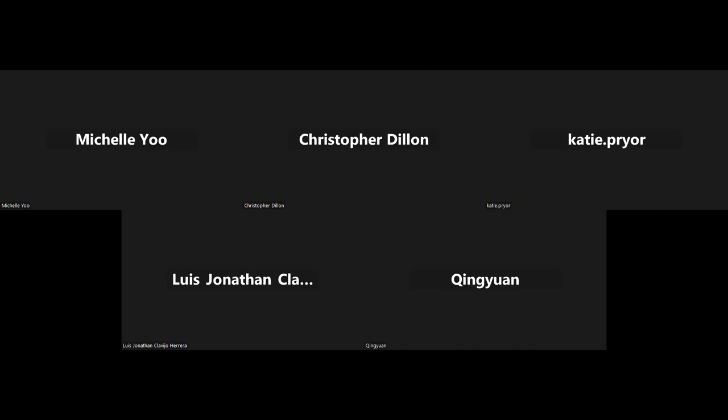Okay. So you showed us about the library, right? Is it possible to get some AI feature? So the AI feature of library building is called Mass Frontier. When you see mzCloud, mzCloud is the database structure of Mass Frontier. Mass Frontier is the tool that Thermo uses to automatically build the mzCloud library, to automatically take that data, assign them to structures, and check whether those structures make sense. There are about 30 modules and a nice AI interface at the end that brings them all together.